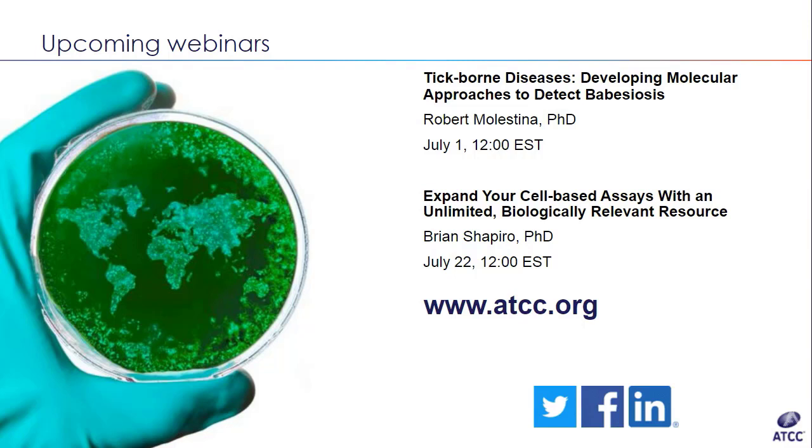All right. Let's see. Oh, here's a good question. Can we calculate the number of bacteria by having the genomic copy numbers in the standards? I think you could establish a ratio if you were running experiments in your lab.